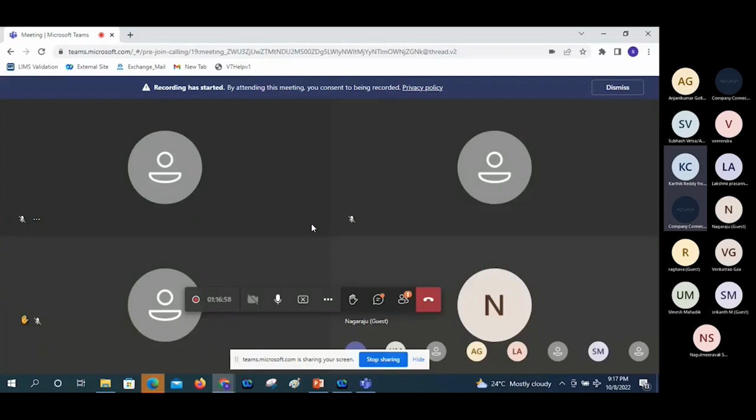50% of IT jobs related to LIMS are asking mainly about master data and administration activities. If they are asking about SQL related things, I can explain them orally, and maybe you can get some knowledge about that. If the real application were available, we could deliver in the training what type of SQL related queries are available through the ad hoc query manager from the LIMS application. Unfortunately, we don't have the LIMS application to explain all the things to you.